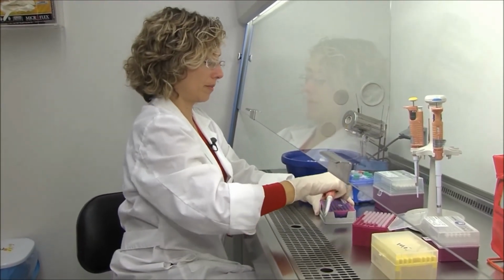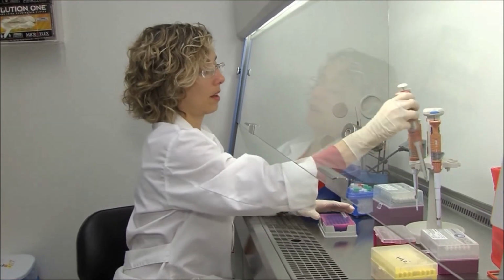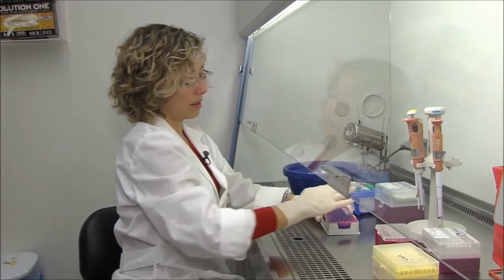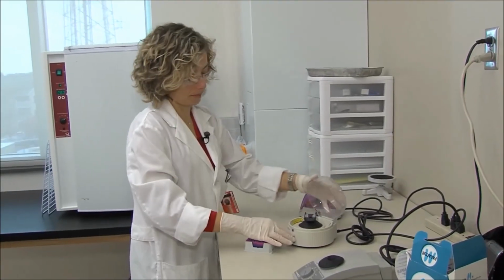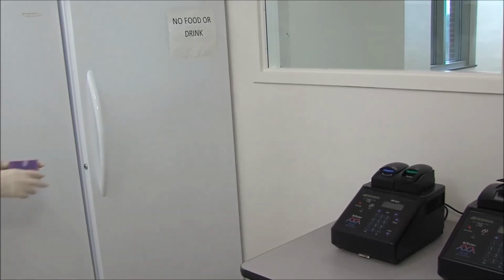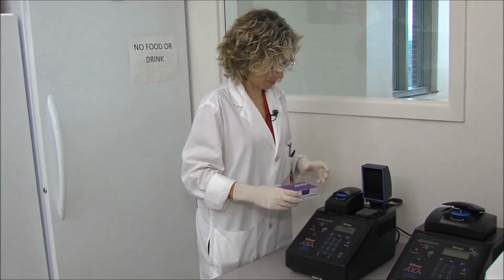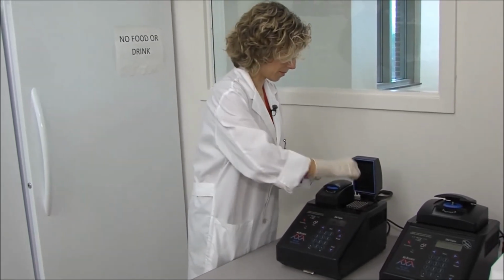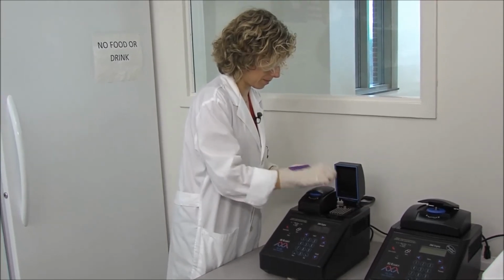Ok. Thông thường thì người ta sẽ cho các mẫu xét nghiệm, sau đó đến mẫu chứng dương và cuối cùng là mẫu chứng âm. So now we just have to take this to the centrifuge, make sure that the volume is spin down to the bottom, and we'll take them to the PCR machine. Ok, sau khi đặt phản ứng xong thì cô ấy sẽ spin down xuống để kéo tất cả các thành phần phản ứng cũng như là mẫu xuống đáy ống và sau đó đặt vào trong máy PCR.